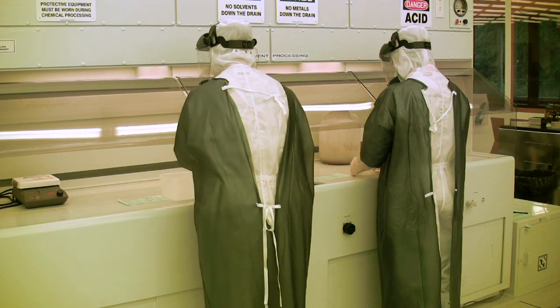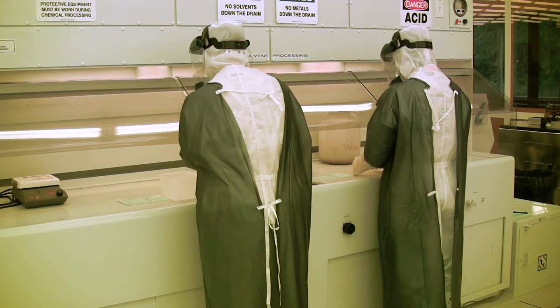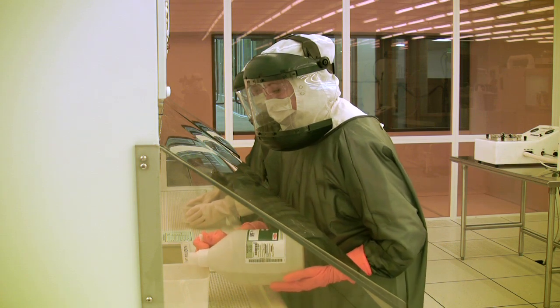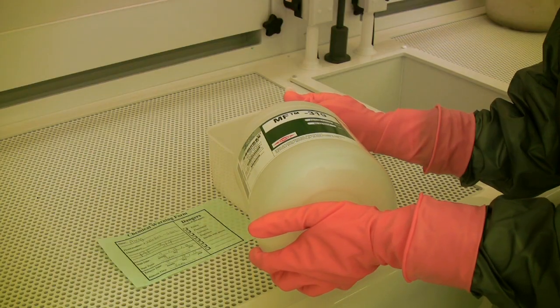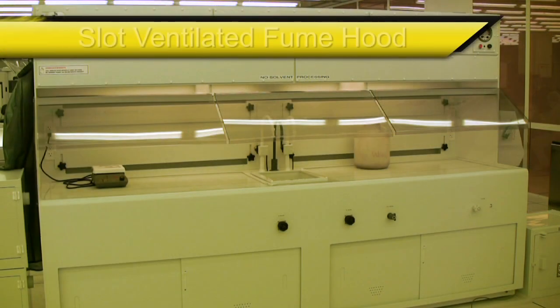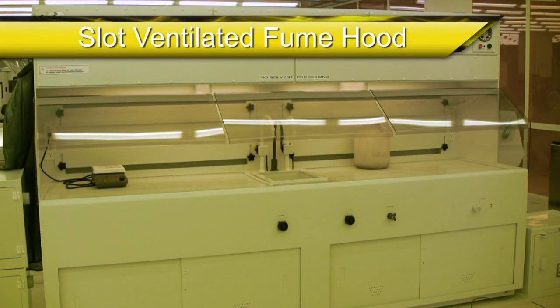The three most important things you need to know about a fume hood is that it is here to protect you, your product or experiment, and the area around the fume hood in which you are working. How you operate in and around the fume hood will determine how effective it is at doing so. For this presentation, we will discuss the slot ventilated fume hoods found throughout the Marcus Organic Clean Room. However, the same basic principles apply to all fume hoods when it comes to safety.